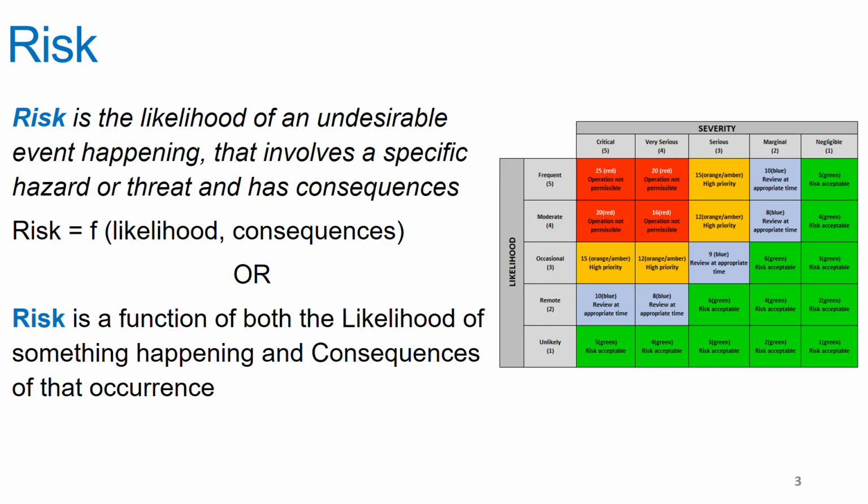The risk matrix in the picture was adopted from the WHO risk assessment template. During this session, we will also look at how you interpret this particular matrix and what each of the likelihood and severity ratings actually tell you about your risk.